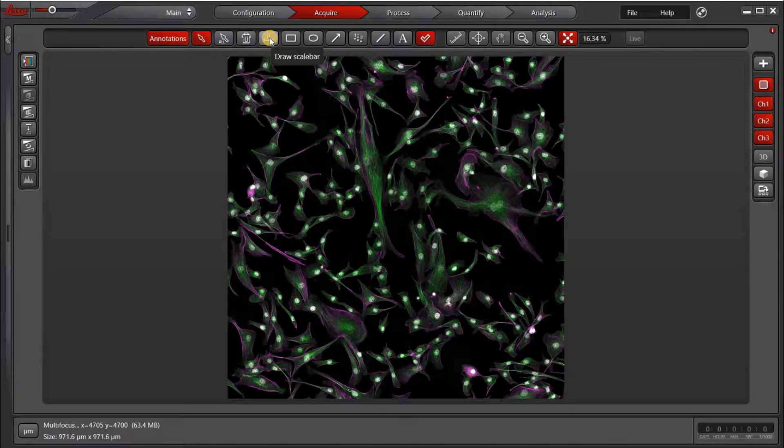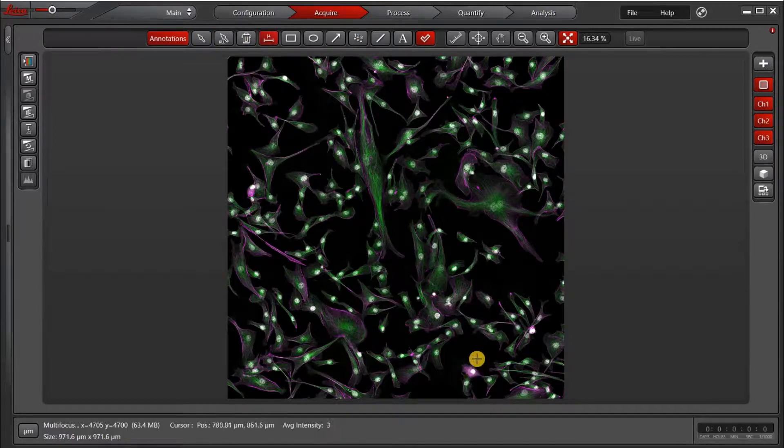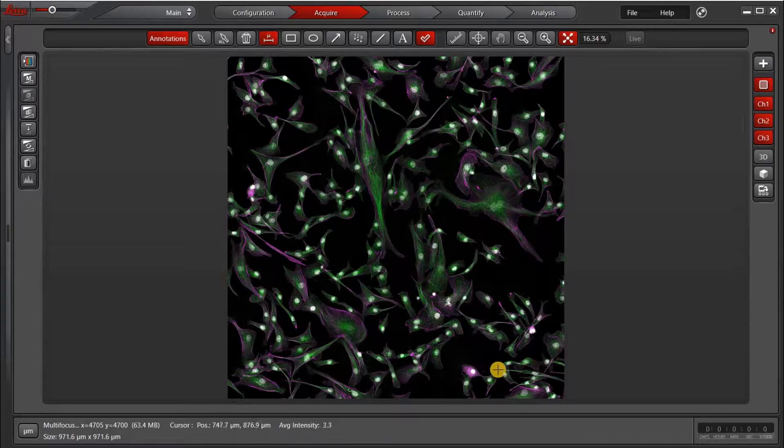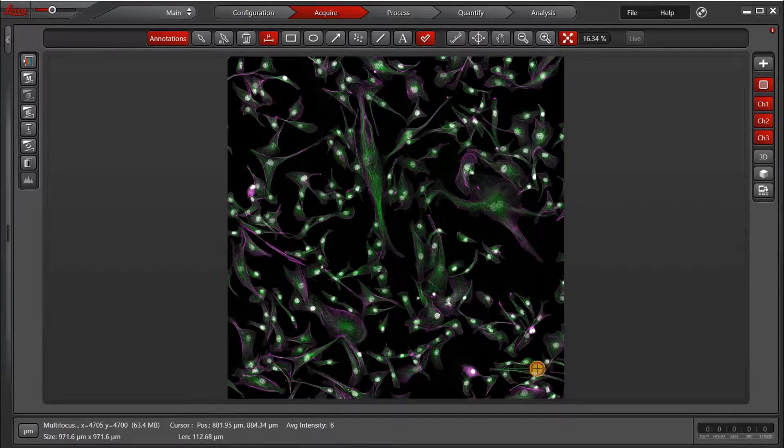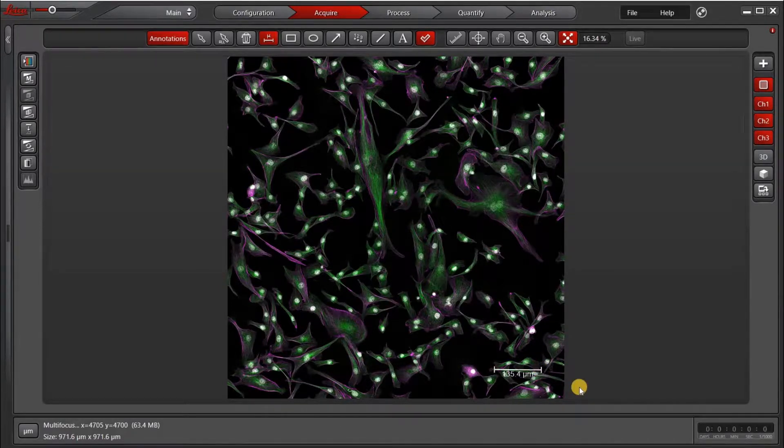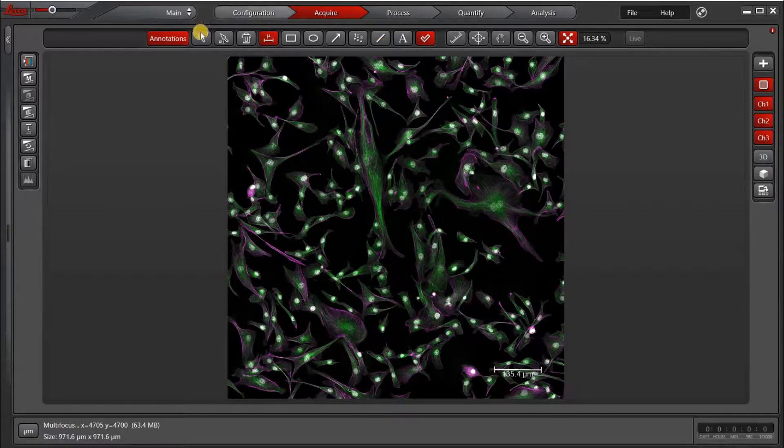Now I'm going to click the Draw Scale Bar icon, and I will draw my scale bar in this corner here. Okay, so you can see that I randomly drew a line.